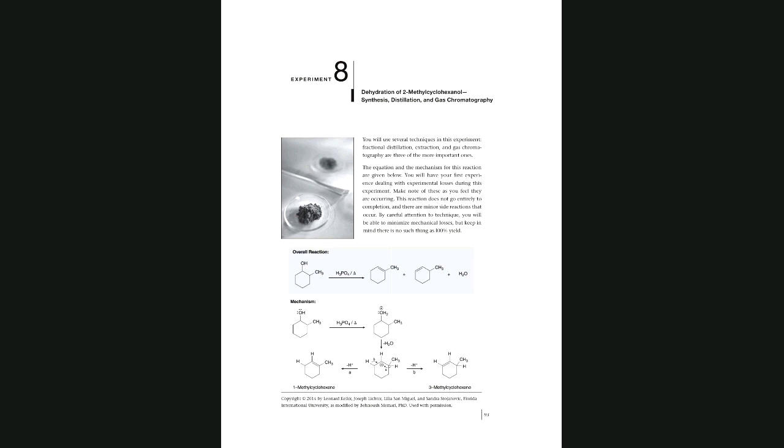You have done a few extractions, so a few distillations. So I'm sure you have an idea. You just have to tell me. When the sample components have different boiling points. So what you expect here is that the boiling point of the product is different from the boiling point of the reactant. Is it different? You see it on the screen.